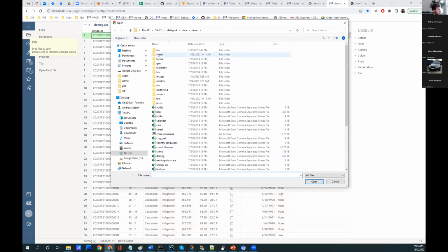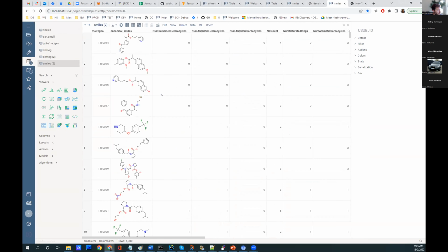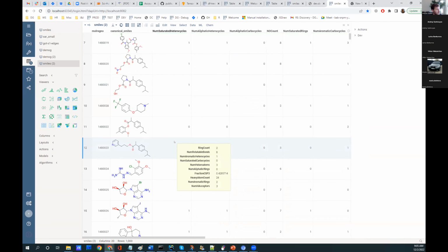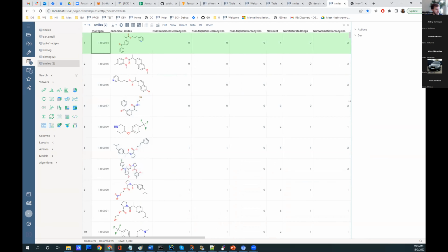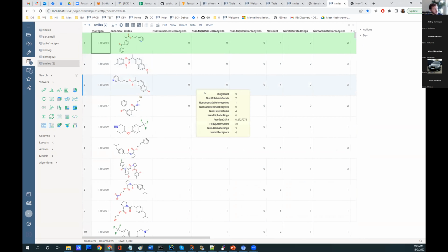Okay, our first feature that we are going to cover today is frozen rows and columns. As you might have seen already, our spreadsheet is a pretty powerful and high performance and flexible one. And today we are introducing a couple of new features.